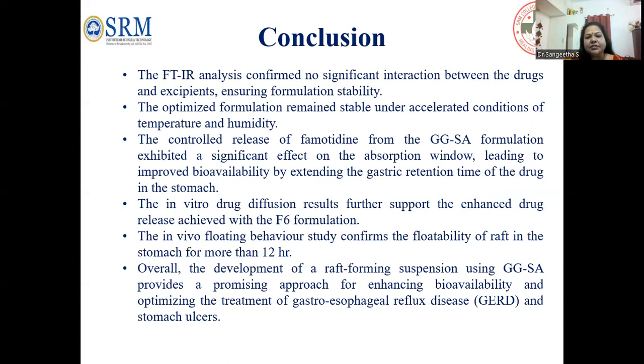The controlled release of famotidine from the sodium alginate and guar gum formulation exhibited a significant effect on the absorption window, leading to improved bioavailability by extending the gastric retention time of the drug in the stomach. The in vitro drug diffusion results further support the enhanced drug release achieved with the F6 formulation batch.